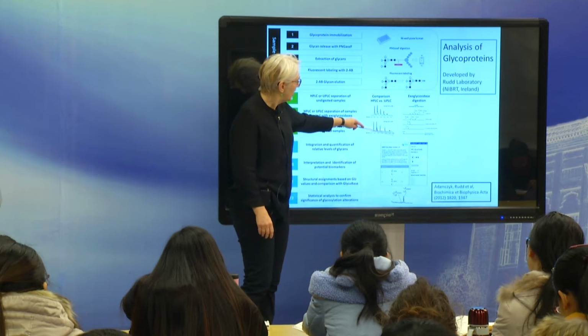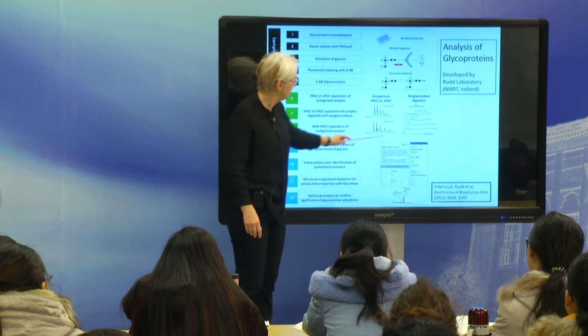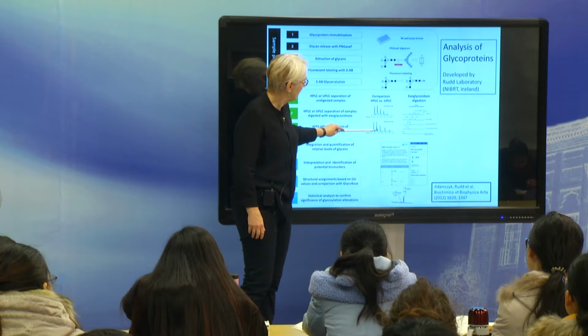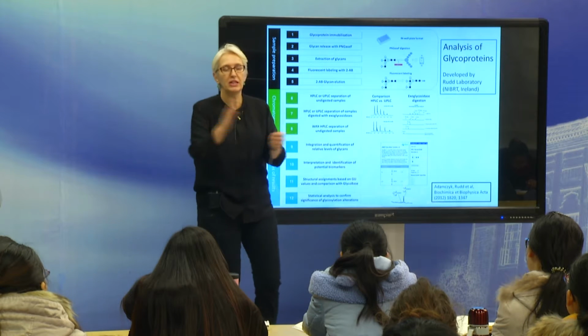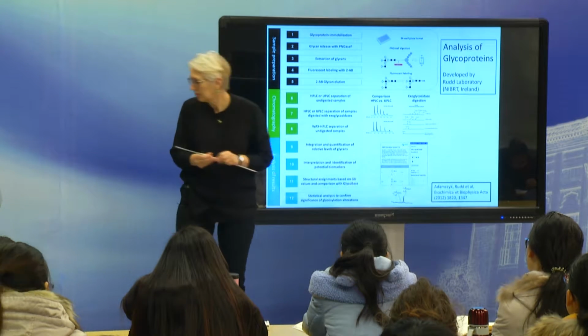So, once all this massive effort has been made, and it has been made now and is put into these databases, we can now look at these profiles and then very quickly assign, not in an automated fashion, but reasonably well. So what experiments are now possible then?